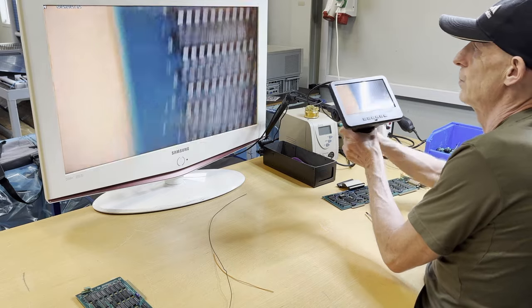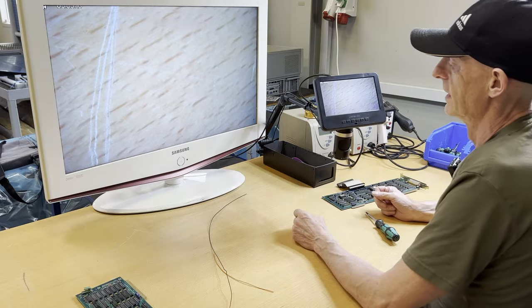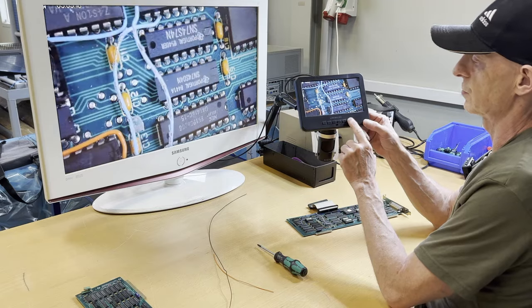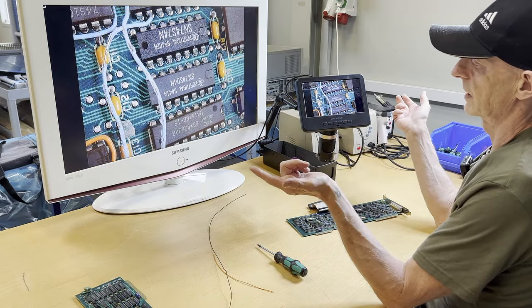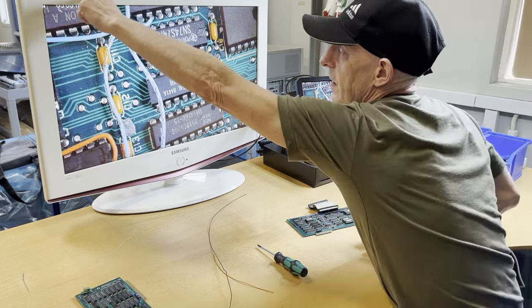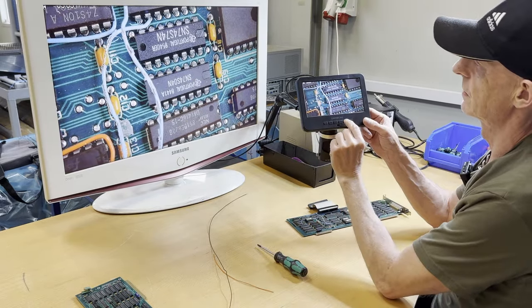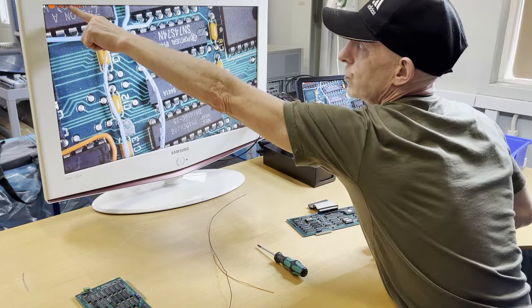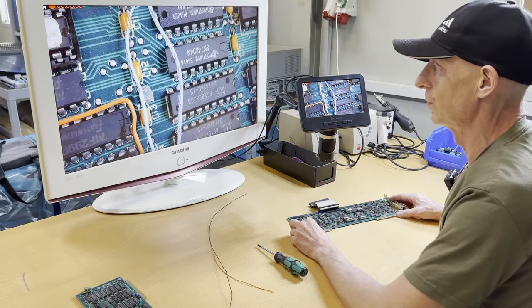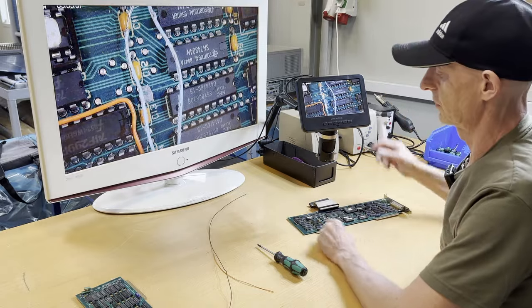One thing I didn't mention at all last time is that you can take a picture obviously. If you press on the first button on the screen, it just takes a picture like this. If you press on the second one, it now goes to red, which means it's now recording everything. So you can easily record stuff with the camera. When you're done, you just press it again and then it's stored on the SD card that's in the back.